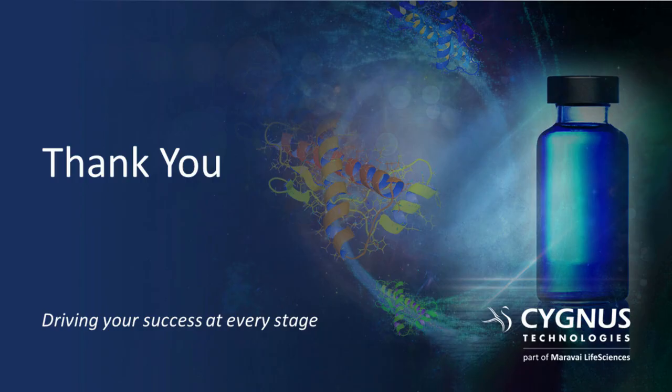Again, with AAE 2D PAGE silver stain, we only count protein spots. We don't identify HCPs. That's why we are so in favor of AAE mass spec, because it truly shows how the antibody is reactive and what HCPs are quantified by your ELISA. But absolutely, you don't need to do 2D Western blot.